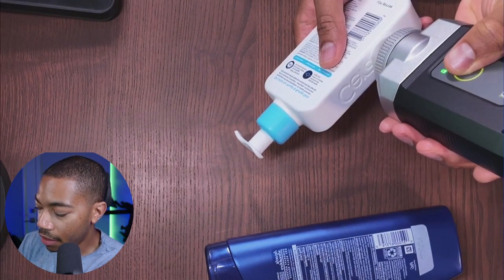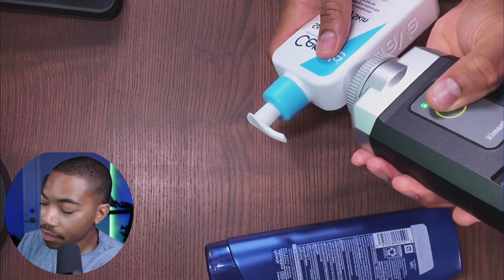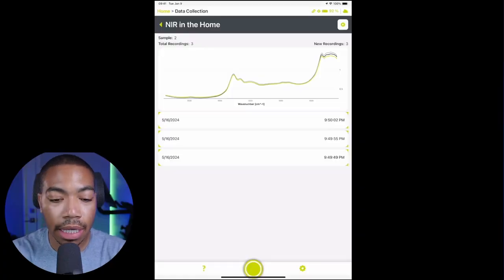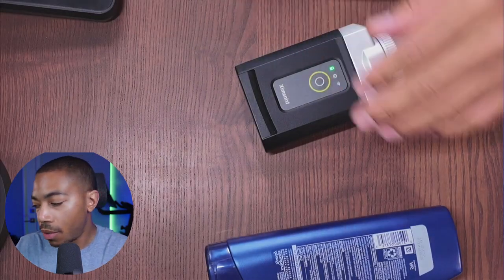It's really fast. And as you can imagine, these should look pretty similar, considering that this is also HDPE. And if we take a quick look at that data, again, very consistent. I won't show you the data for everything until the very end, but I at least want you to see where we're beginning. And let me now switch to another sample.